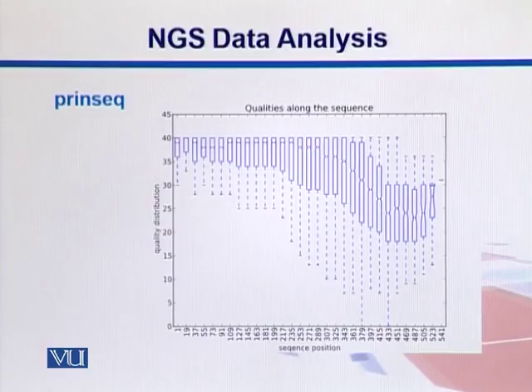where we are putting these quality scores. This representation is called a box and whisker plot. We will cover it in a statistics primer later on, but just get a general idea. So these boxes represent where we have the middle 50% of the values, and then obviously we have a lower 25%. Let me draw it somewhere here.